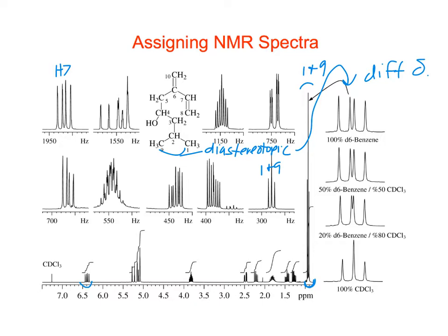Okay, now the other double bond protons all kind of overlap a lot. One thing that we could do is that trick that I had mentioned, as long as they plotted everything at the right scale. So we could look at this, and I'm going to pick out the trans coupling, the bigger coupling constant, and slide it over here and see what matches. See, this one matches right here.